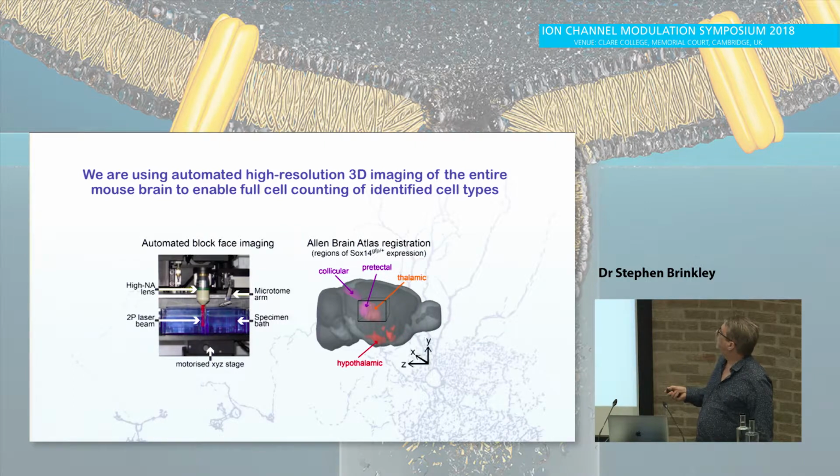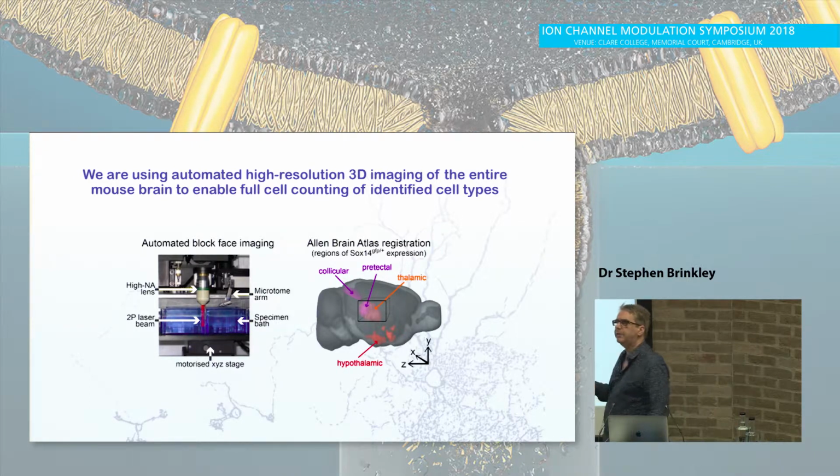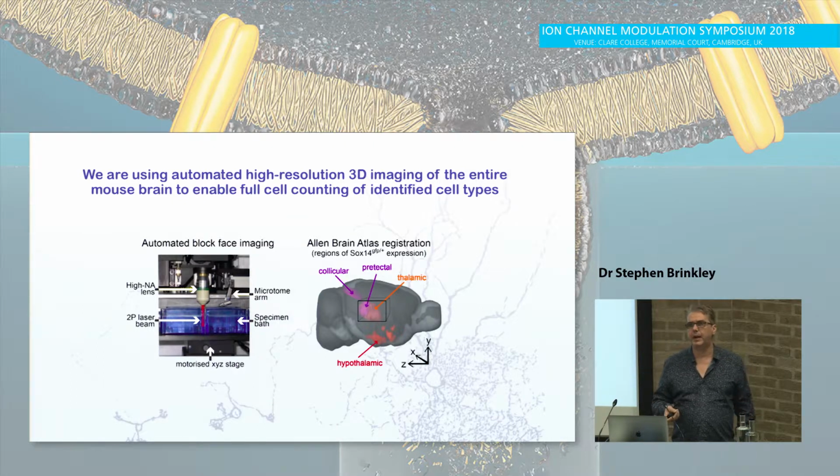We're using, first of all, we want to image the brain, and we're using what's called a TissueCyte system, which is an automated block face imaging system. The Allen Brain Atlas use a lot of this. They've got 8 of these machines. There are 2 of them in the UK, and we're fortunate that we've got one at Imperial College as part of the Centre for Neurotechnology, which is an EPSRC-funded initiative.